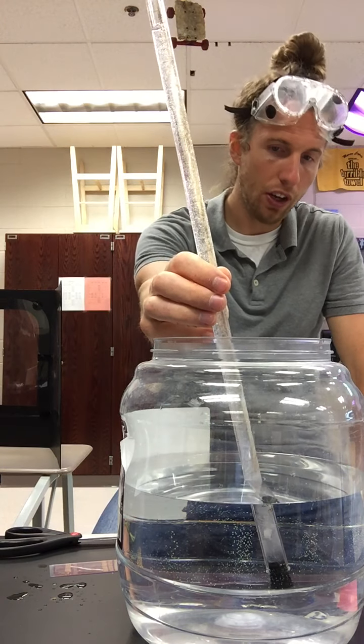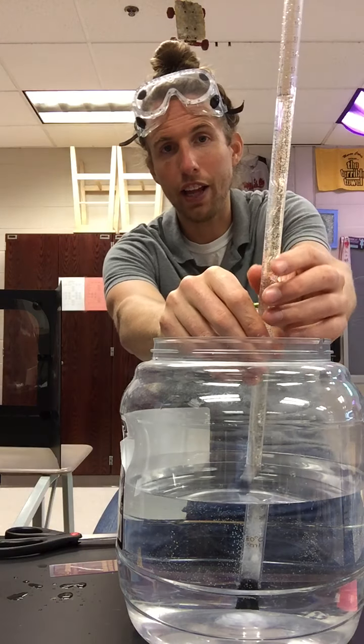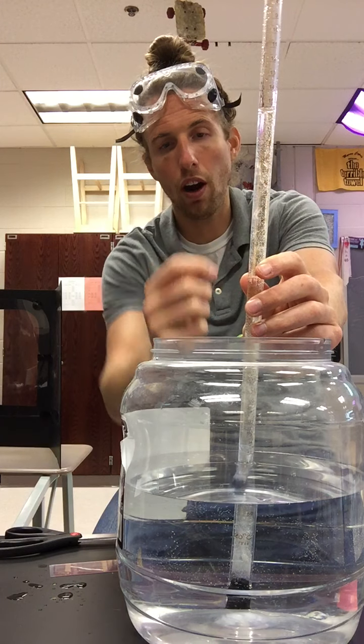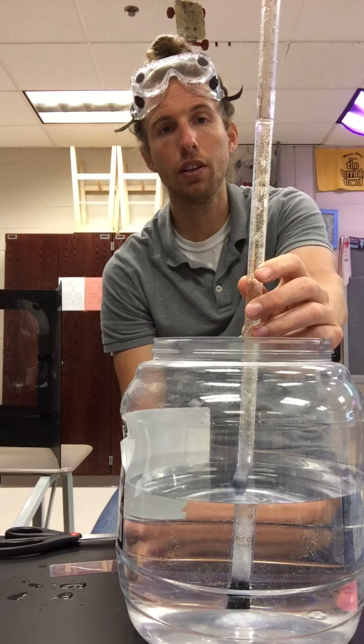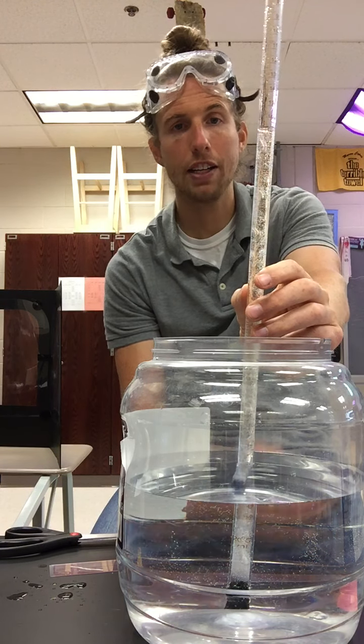You'll notice that we're still giving off bubbles. I don't know if it's on your screen yet. There it is. So right here, this is the amount of water going down as we're forcing water out of the eudiometer and replacing it with gas. And you can see that the reaction is happening relatively quickly. We want to continue this reaction until we have no more hydrogen gas.